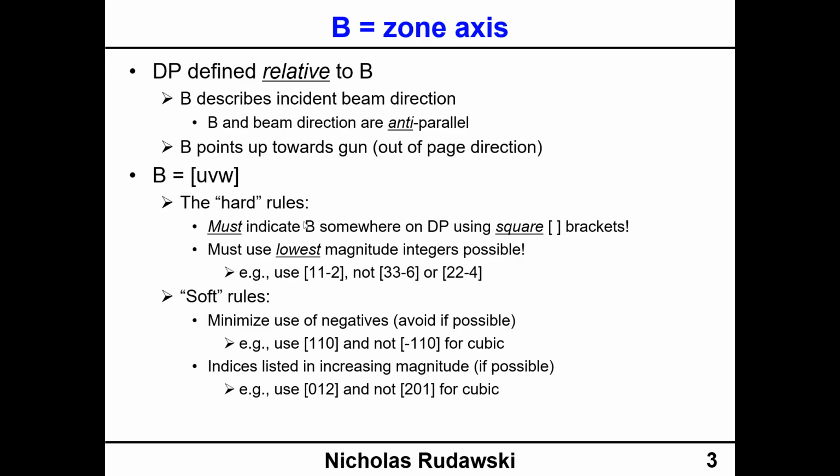So I'm going from simple cubic to body center cubic to face center cubic and to diamond cubic, but I'm keeping the lattice constant the same. So what we can see as a result is that we will tend to get some changes to the appearance of the pattern. Namely, we're going to see spots some of the time, not all the time necessarily, actually disappear from our patterns.